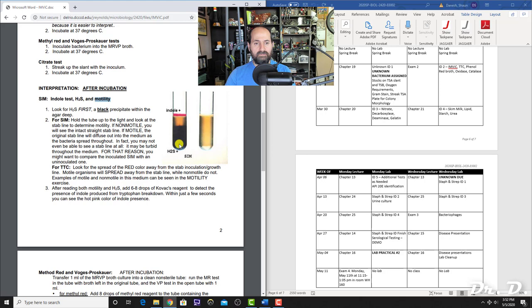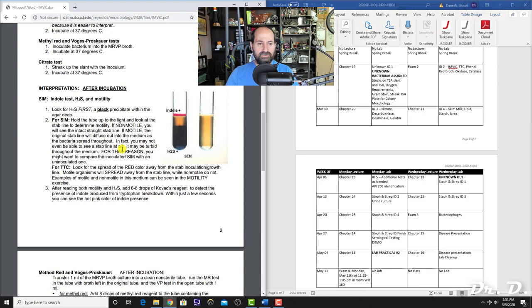To inoculate a SIM test, you stab it. If it turns black after incubation, that's indicative of H2S production. For motility, if you see cloudiness inside the tube, the bacteria are motile; if you only see growth along the stab line, the bacteria are not motile. To test for indole, add Kovac's reagent—if there's a pink line at the top, that's indole positive; no pink line is indole negative.